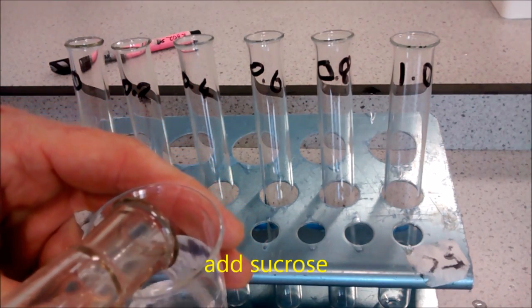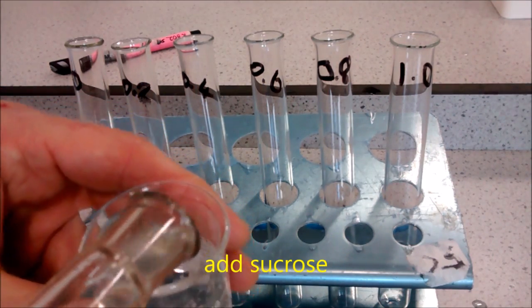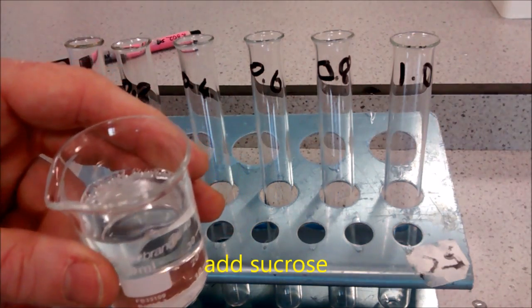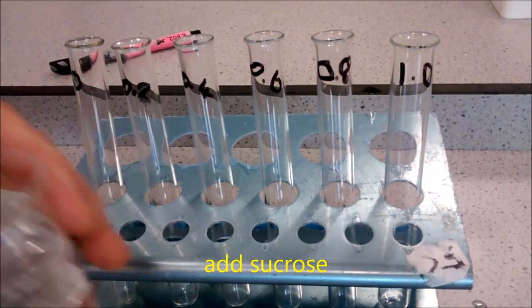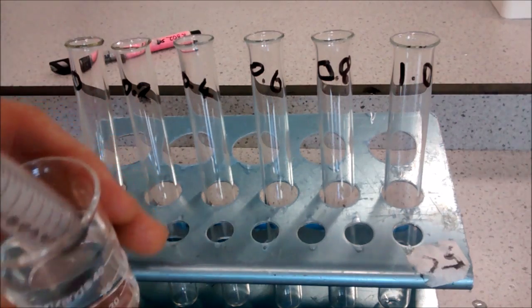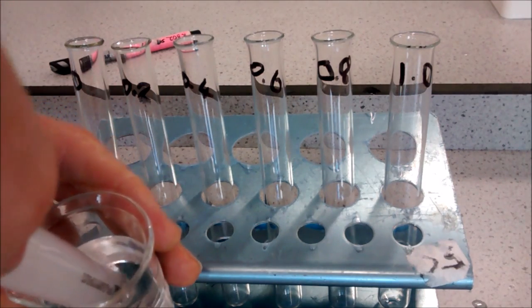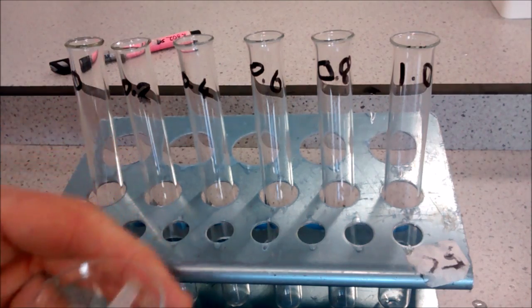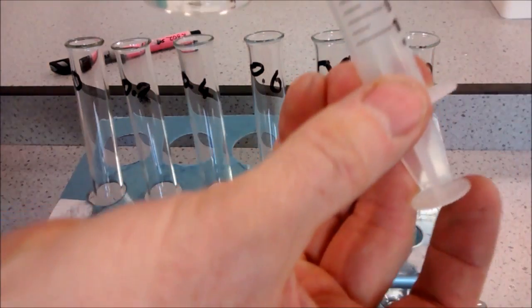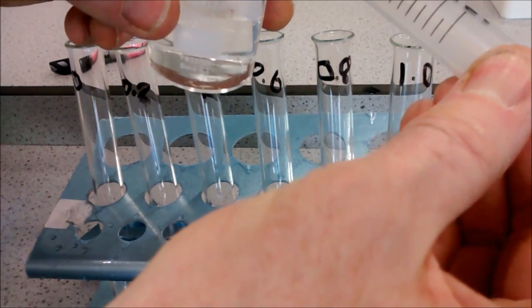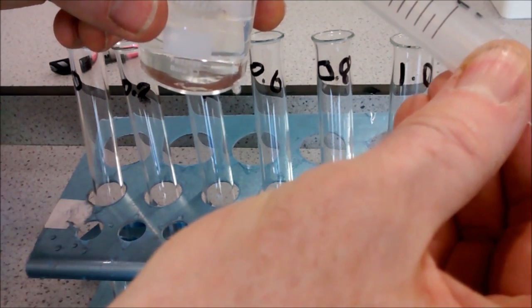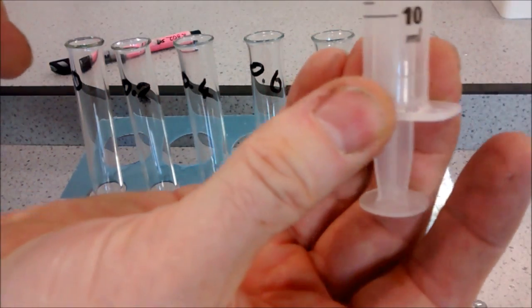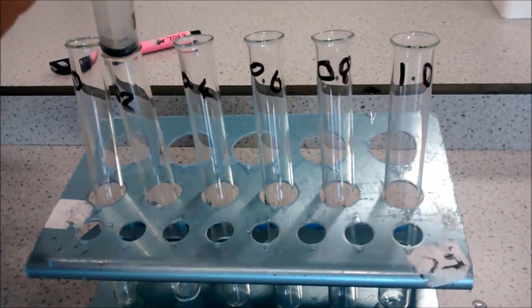Put some sucrose into the beaker and add the correct volume. For the 0.2 molar, we need to add two cubic centimeters. Use your syringe to dispense to the line with the black plunger. That's two cubic centimeters. In it goes.